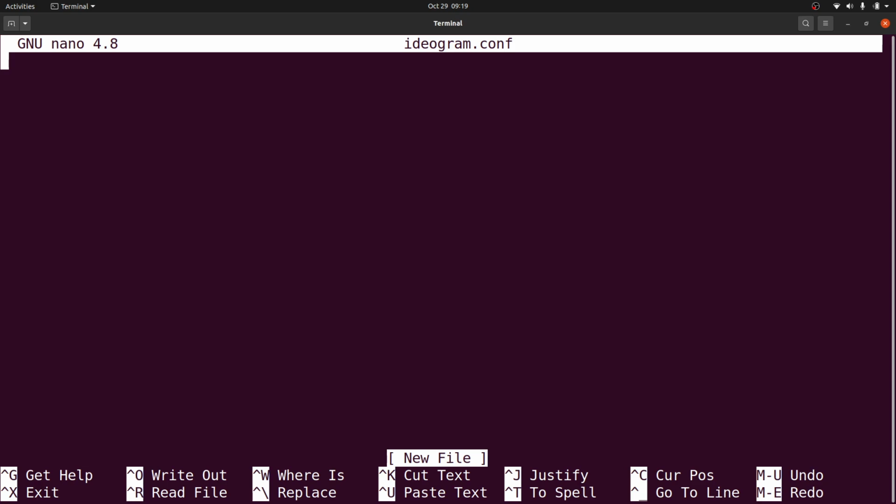Okay, so let's do this first. Let's first open our block. I'll say ideogram, and then I'll close it with this one, /ideogram, like this. I have that block. Okay, that's very, very important. Then after that, I'll put another block here for spacing. Then I'll close it like this. Okay, so that's this.